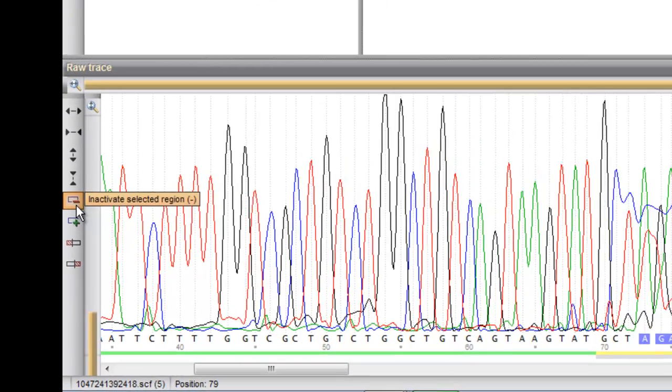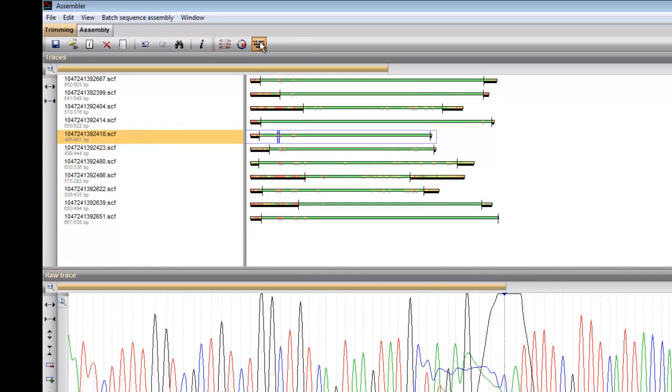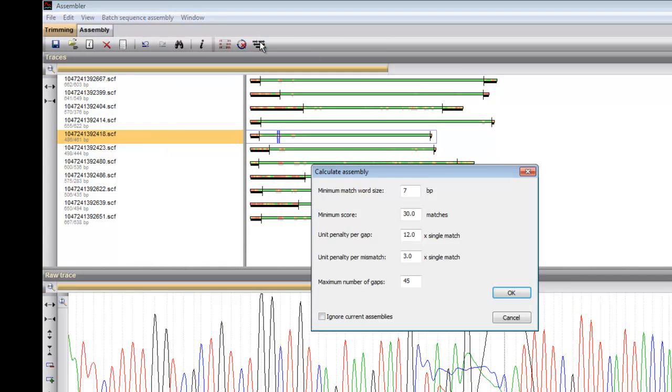Now we will move to the next step and assemble the sequences. I will do so with the default settings.